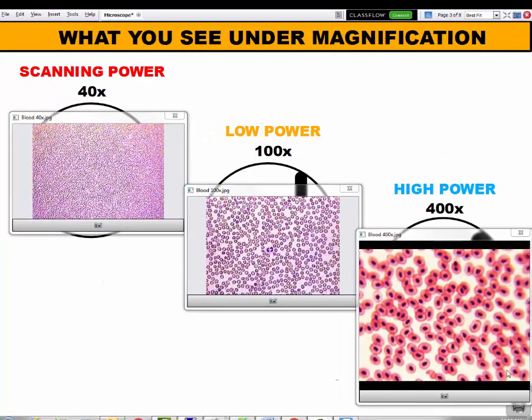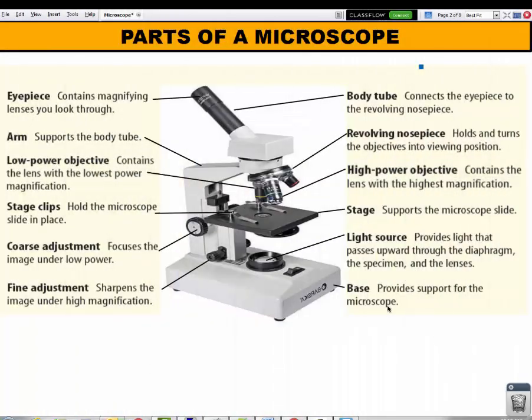So let's go take a look at the rest of the parts of the microscope. Okay, so underneath the objective lenses we have what's called the stage. The stage is the platform where you clip your slide on and this is where we view the specimen. Kind of like when you go see a band, they perform on the stage, that's where everyone looks to see them. That's where we're going to look to see the specimen on the microscope.